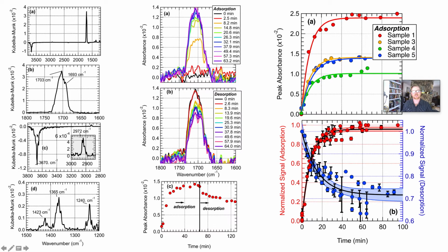The reason this is a very sharp single hydroxide instead of the broad symmetric, asymmetric stretch like we talked about is because these are bound hydroxides. These are not like liquid water where there's a symmetric, asymmetric stretch. So it's just a single bound hydroxide stretch.